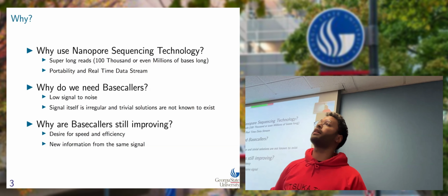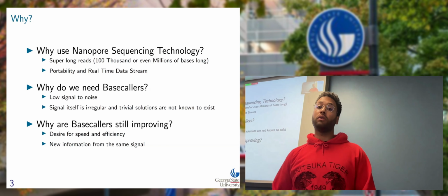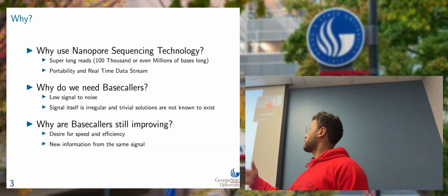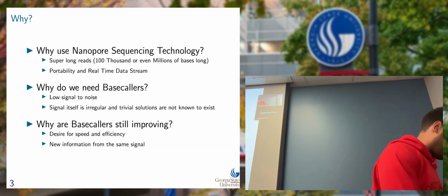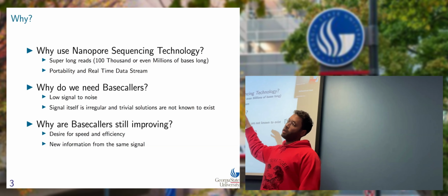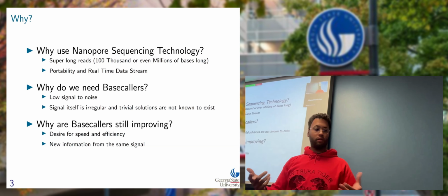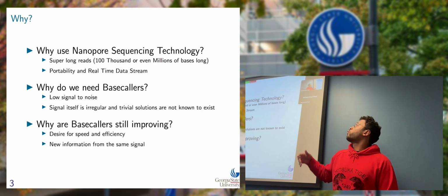Well, first of all, unlike short read sequences, with these long reads, actually super long reads, sometimes 100,000 or even 1,000,000 bases long, we can detect structural differences like large deletions, or large structural variations, right? Not only that, but with Minion, which is a somewhat newer platform, well, pretty much all of bioinformatics is relatively new. Minion is small enough to fit into a backpack, and you can do all of your sequencing on this. That's why you would use it.